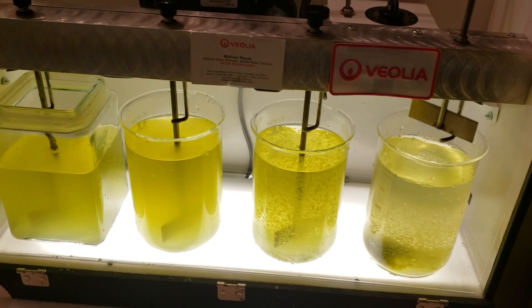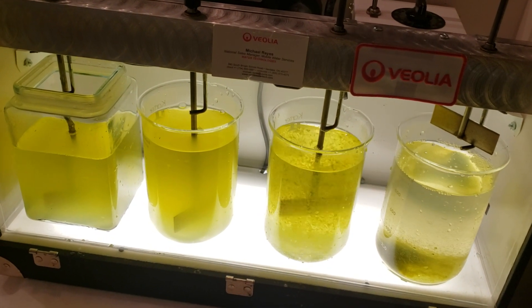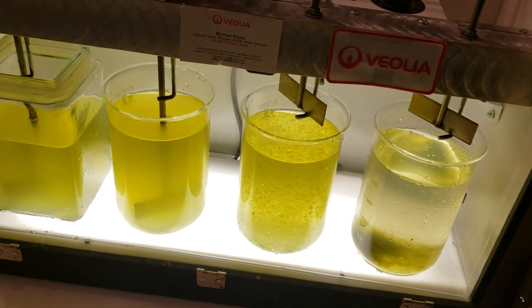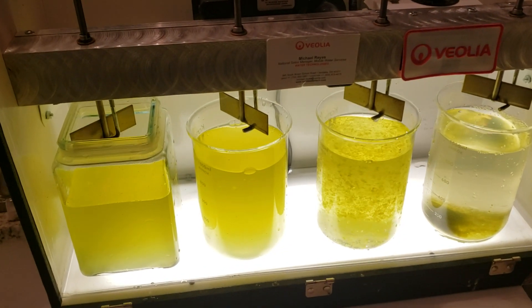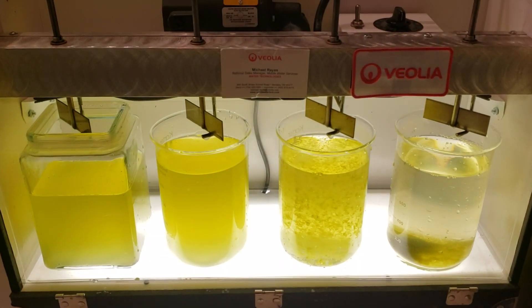Today we're doing a little bit of jar testing on a lagoon sewage treatment plant. This is the water coming out of the settling section of the lagoon and we've got a few different jars here. The first jar on the far right is raw lagoon effluent with no chemistry added.